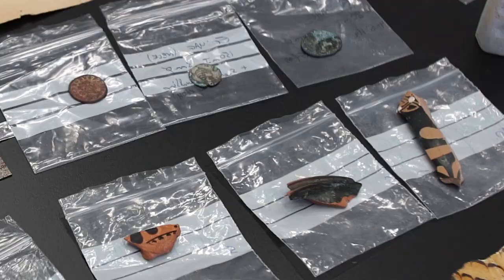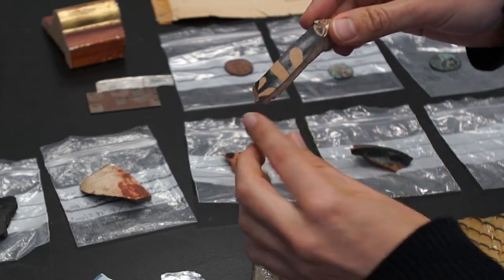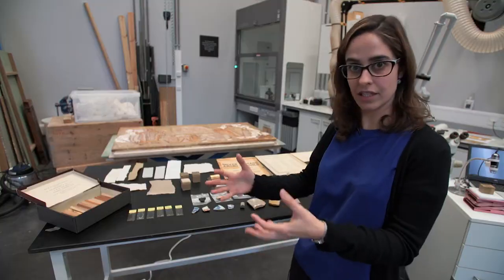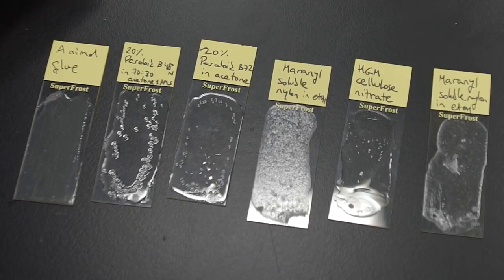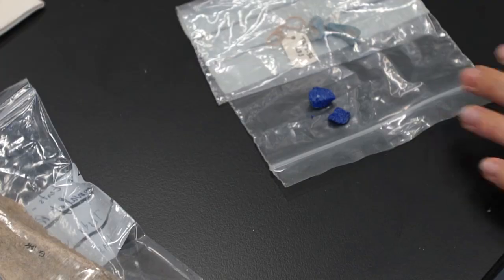Before treating a real object, I need to make sure that the treatment is first efficient and second safe for the materials. So I used a reference collection of samples to experiment first. Some of these objects are very old, which is actually good because they are naturally aged and that better reproduces the reality when you are treating an ancient object. It's a very useful resource for preliminary testing to make sure that when you use your laser on the real object you have everything under control.